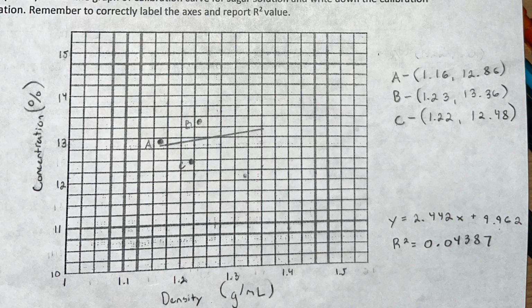We were able to graph our data by having the x-axis represent density and the y-axis represent the concentration percentage. After inputting the data points, we were able to create the calibration curve for the sugar solution and find both the calibration equation and the r-squared value.